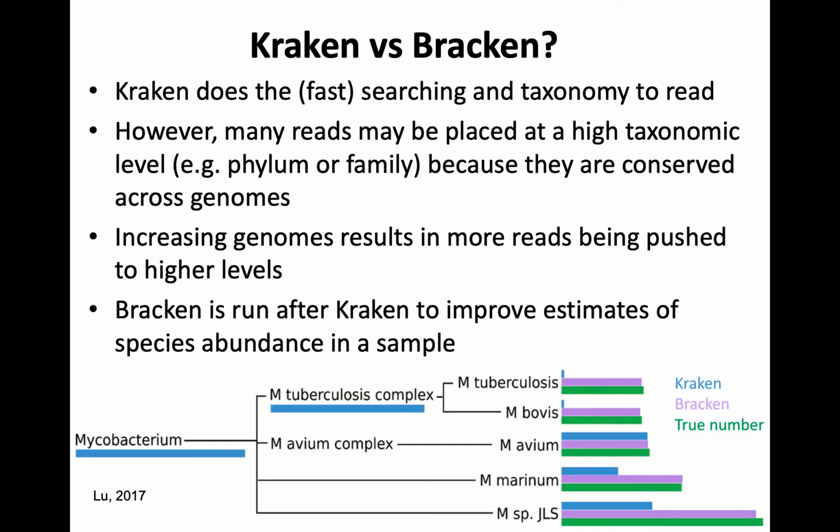And so Bracken is this approach to try to account for that, to say, well, look, we have these reads assigned to this one node. We've pushed this up to a certain level. Bracken will try to actually push the resolution back down to improve it based on multiple reads hitting a particular organism. I'm not going to explain it all, mostly because 1, I don't actually understand all of it. But 2, it's just too complicated to get into here as well. But yes, usually if you're going to run Kraken, you're going to have to run Bracken after it to improve your resolution. That's the take home there.